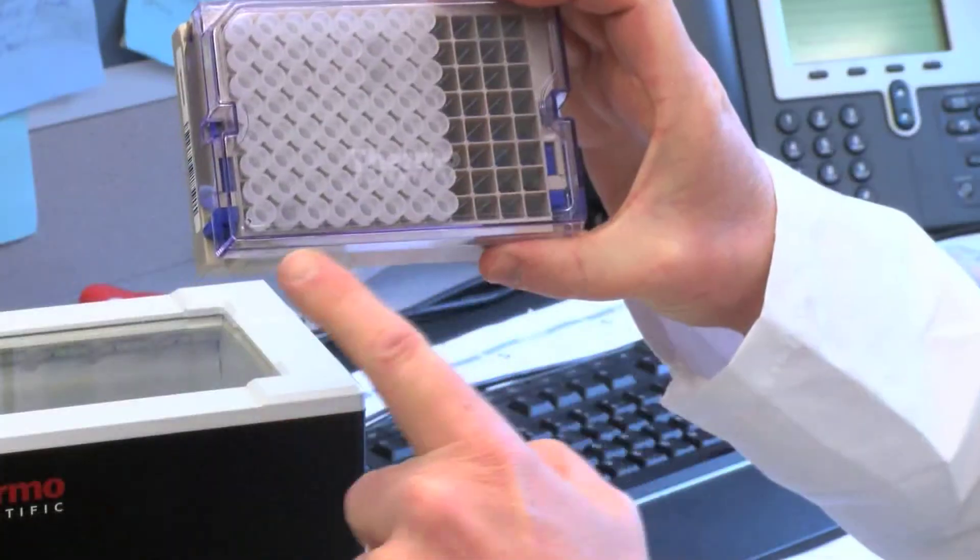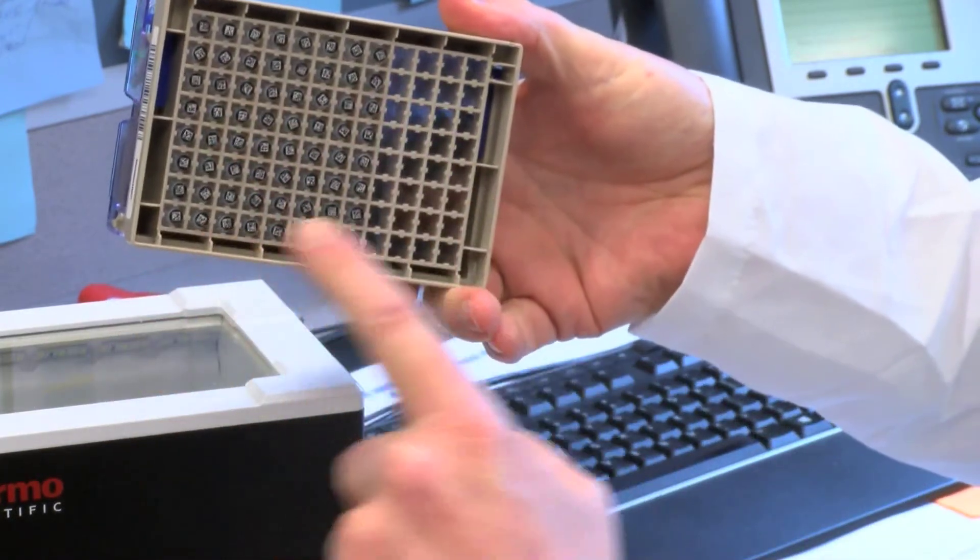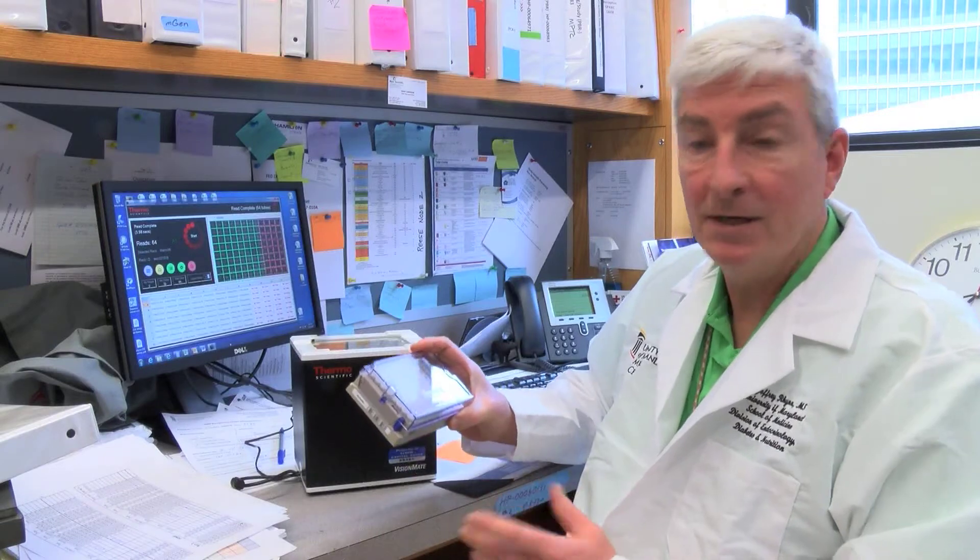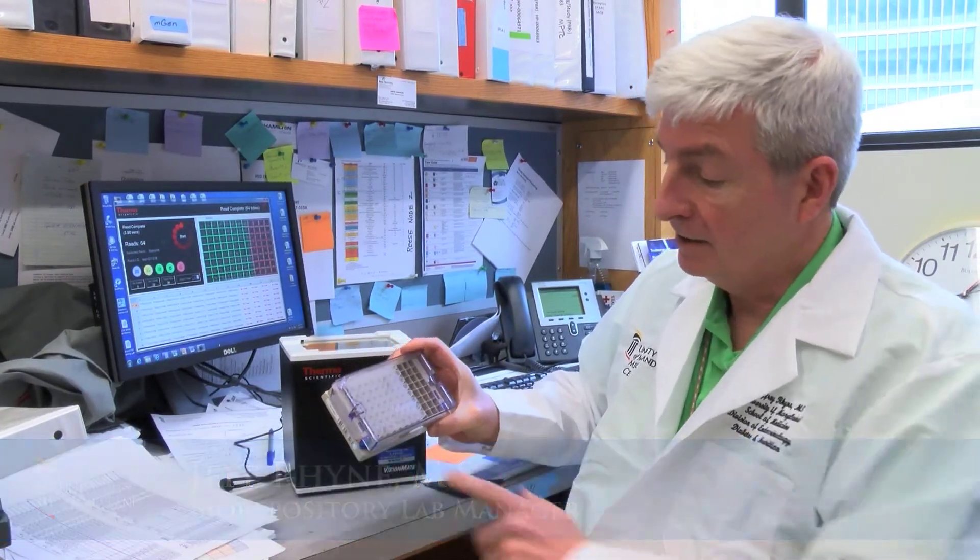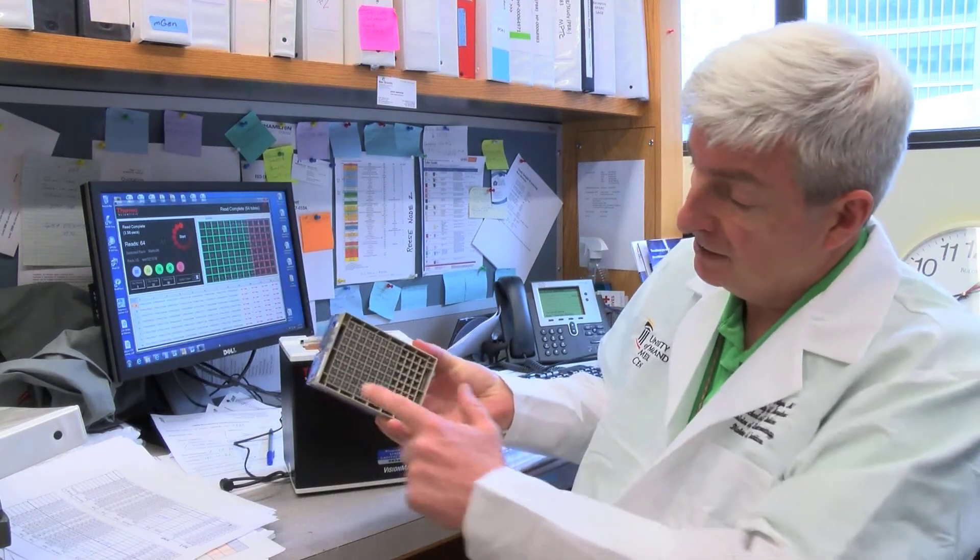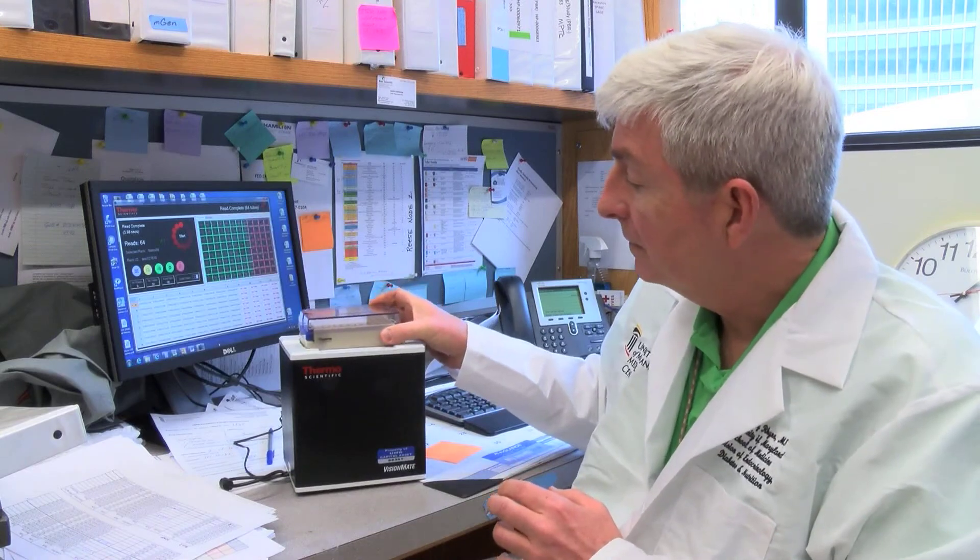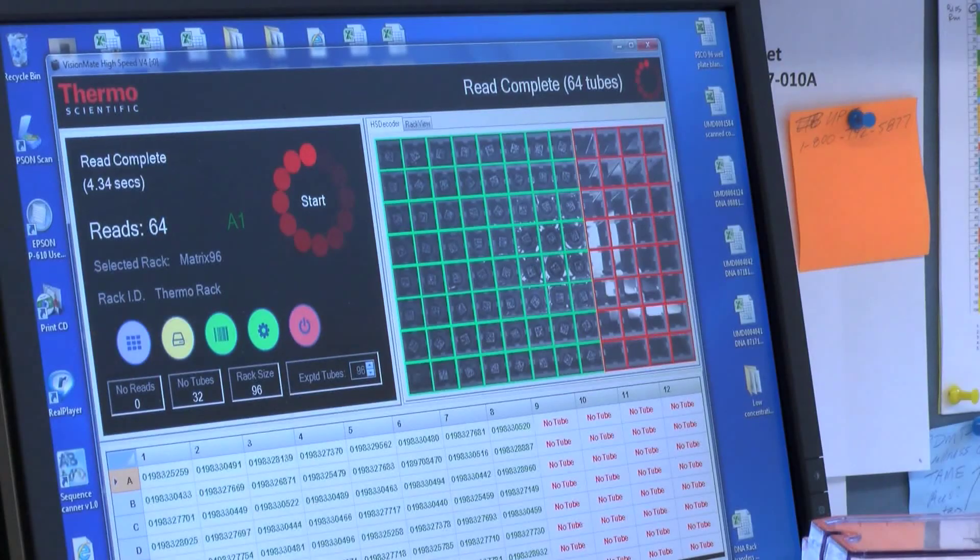Each sample gets a unique barcode so that it can be tracked by computer and retrieved by the robots inside the freezer. What we have here is a sample rack with samples. They're 2D barcoded samples. The 2D barcodes are on the bottom and our reader is right here and we'll read the samples.